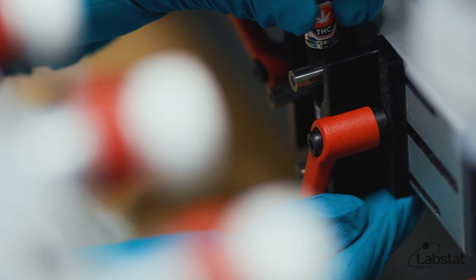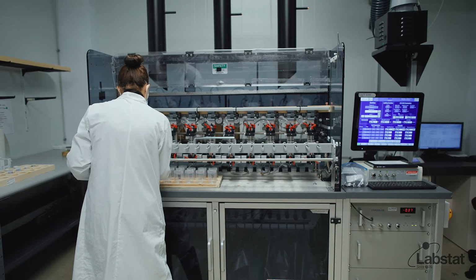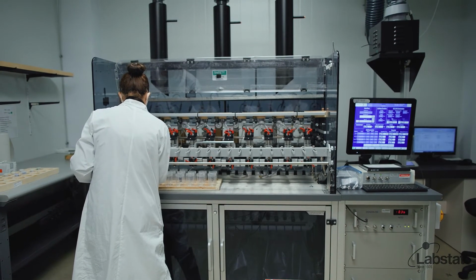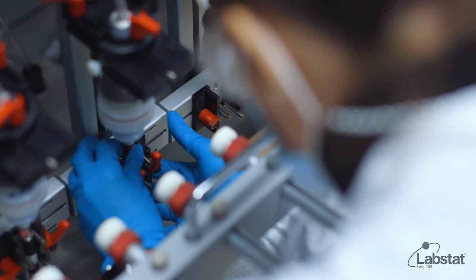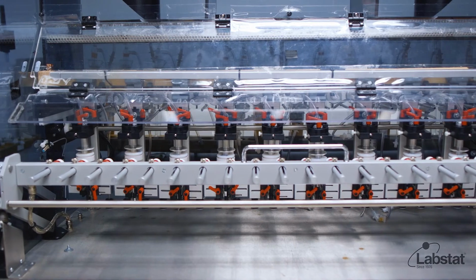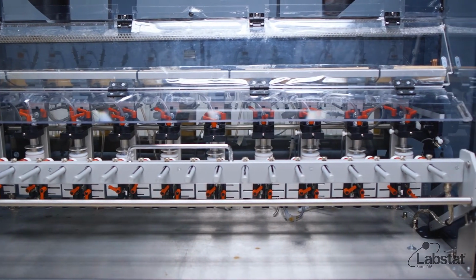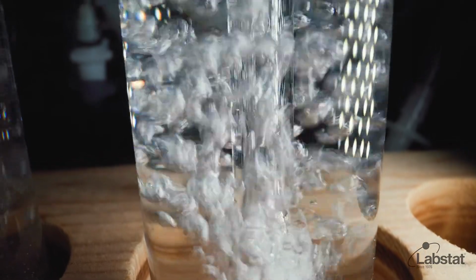Similar to determining the shelf life of a consumable product, cannabis vape cartridges should always undergo stability and life cycle testing. Life cycle testing measures the device performance at the beginning, middle, and end of the cartridge life. This provides the insight your product development teams need to ensure you're creating a consistent, high-quality experience for your customers.